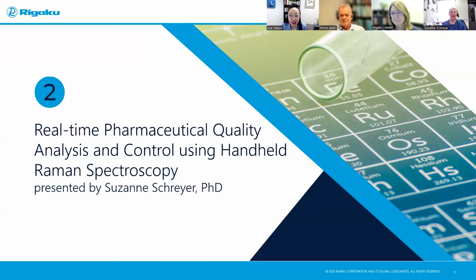Welcome to the second part of this talk in this series. My name is Suzanne Schreyer, and I'm the senior scientist for the Raman analytical devices. And my talk will focus on real-time pharmaceutical quality analysis and control using a handheld Raman spectrometer. So we're going into the world of molecular spectroscopy at this point, and we're also going to the world of portable instrumentation.